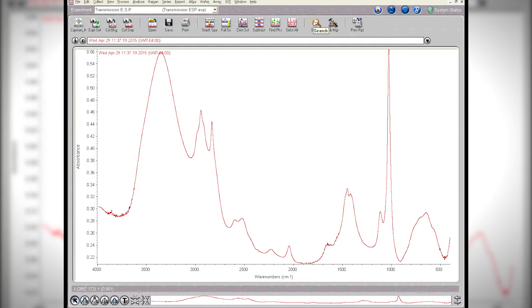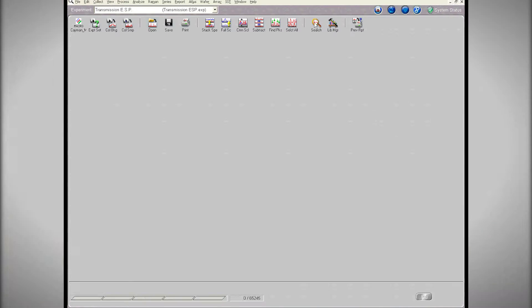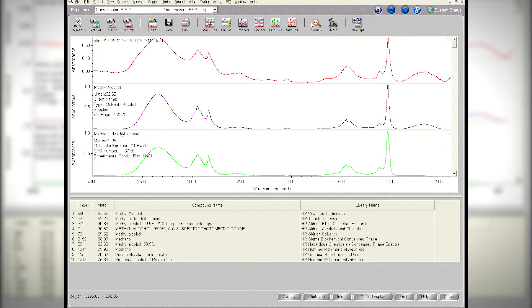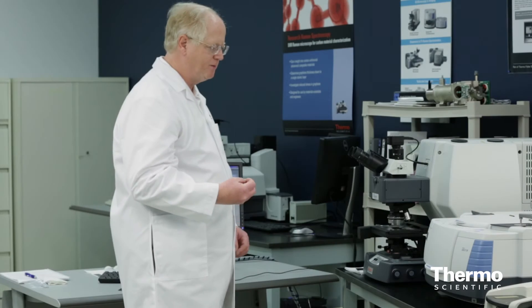I've already set up some libraries, so I'm going to do a search and see if it can identify what that material is. The search returns a very high result: methyl alcohol, which is indeed what I put in there.